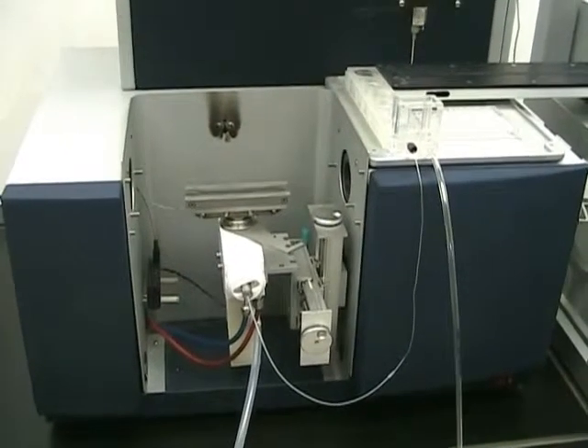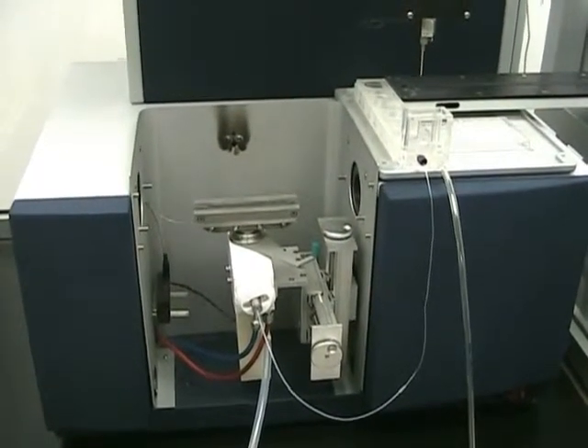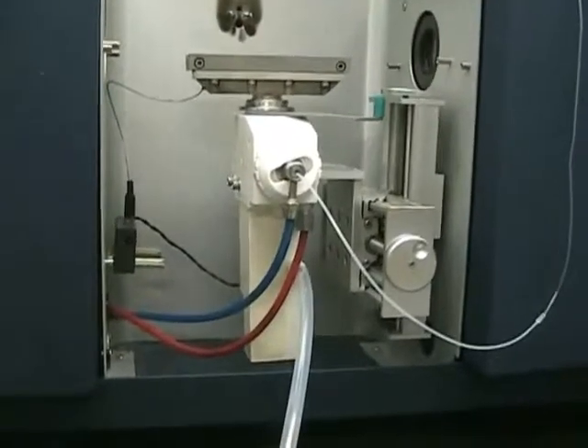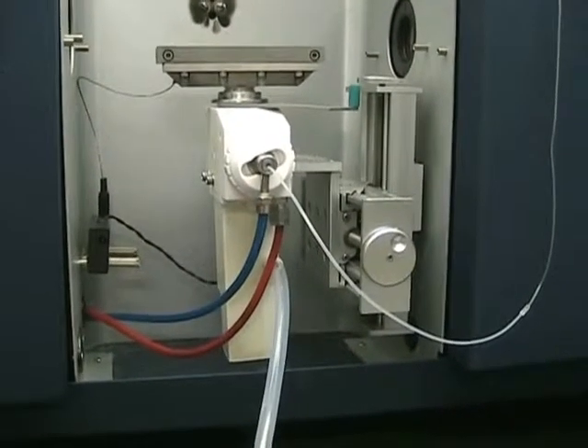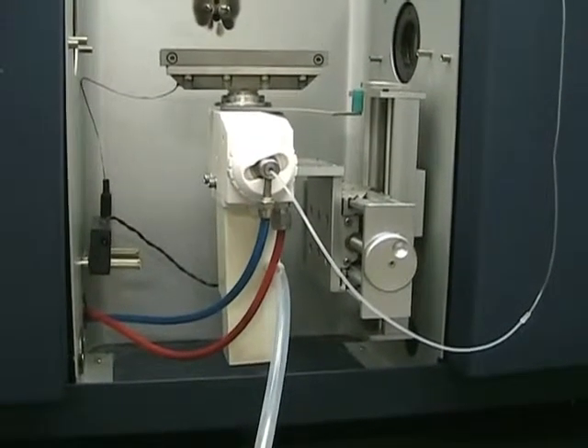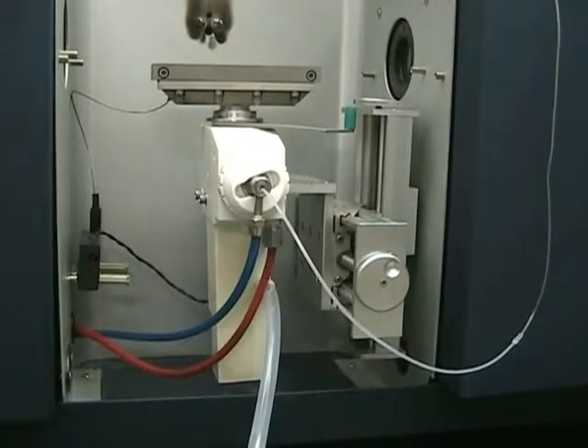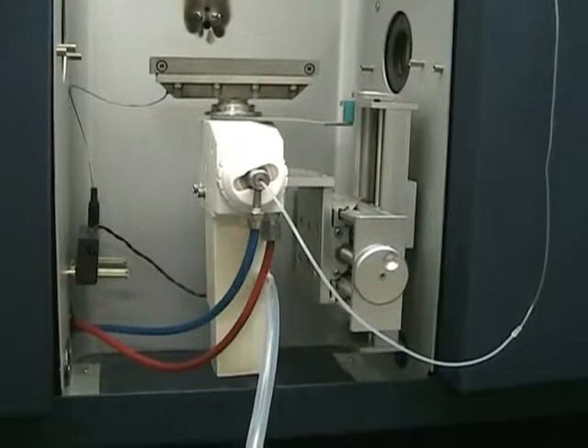A few things we did to the machine itself: we cleaned the flame head, and then we replaced the float sensor switch in the bottom of the trap because it wasn't detecting that there was fluid in the trap. We also put a brand new nebulizer in, along with the old nebulizer that was in it when we got this unit.